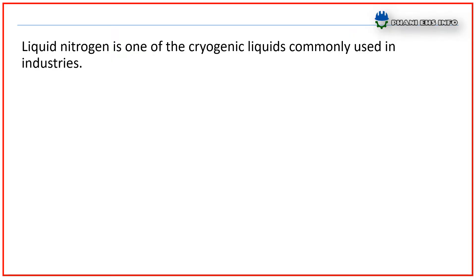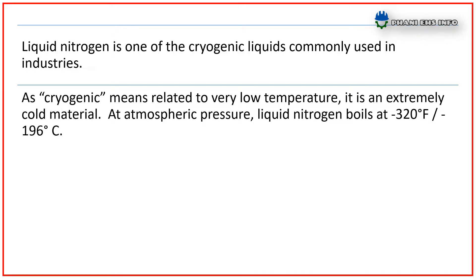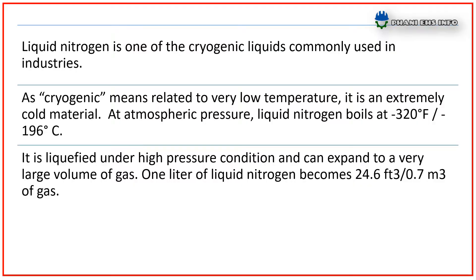Cryogenic means related to very low temperature — it is an extremely cold material. At atmospheric pressure, liquid nitrogen boils at minus 320 degrees Fahrenheit or minus 196 degrees Celsius. It is liquefied under high pressure and can expand to very large volumes of gas.